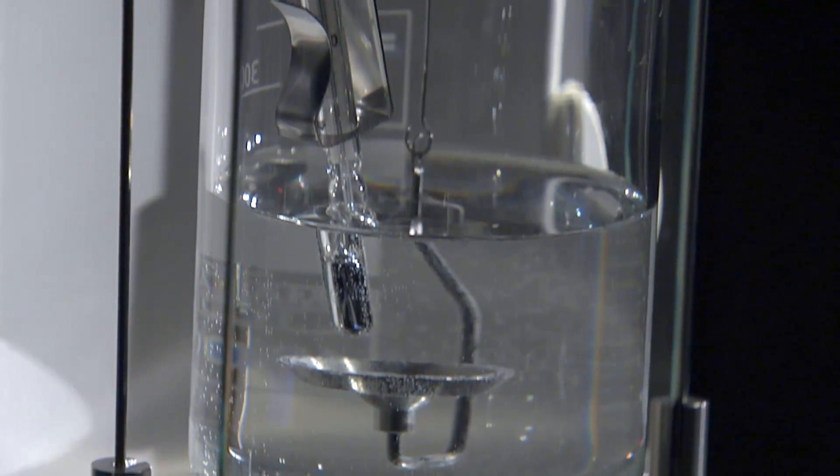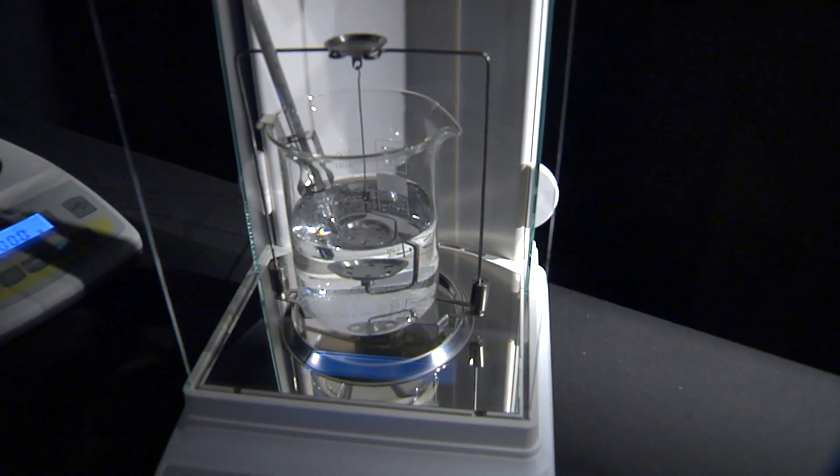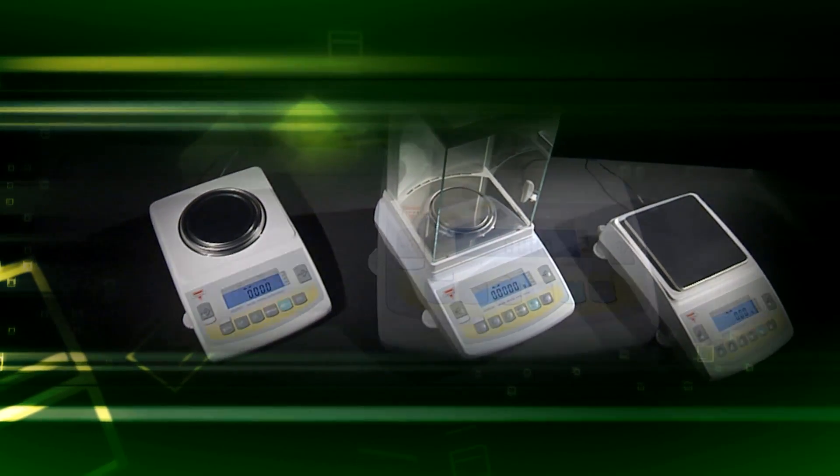When choosing the AGC series, you can be sure you will receive the essential precision, performance, and reliability required by everyday weighing applications.